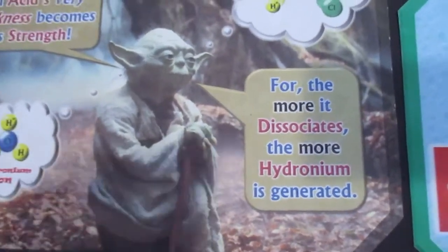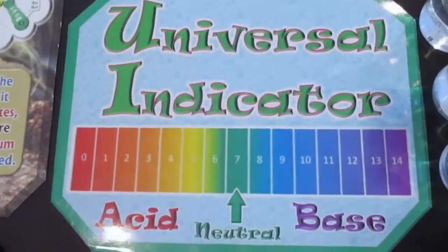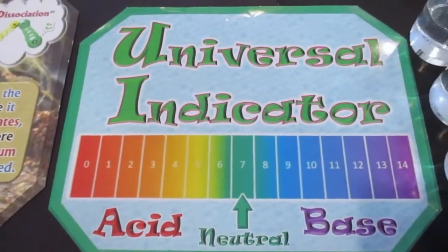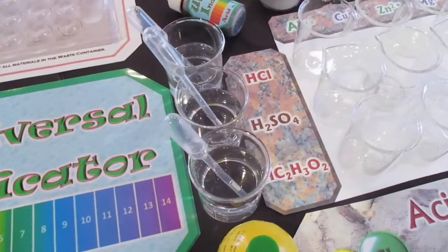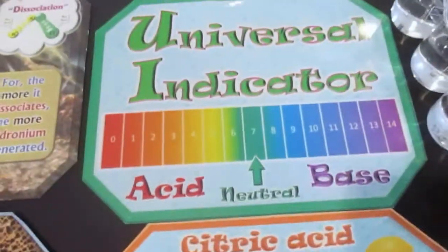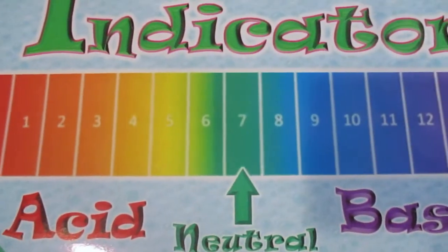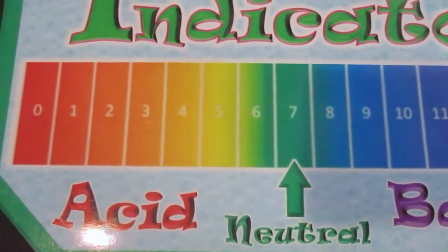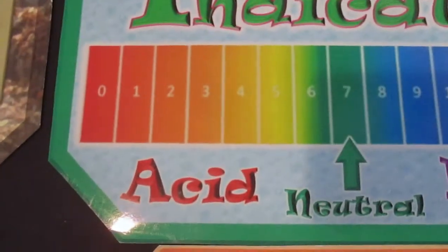And then, of course, we have a scale for measuring that: the pH scale, which measures the concentration of hydronium or hydrogen ions in a solution, the power of hydrogen. These are all acids. So what color do we expect it to turn when we put in the drops of universal indicator? Certainly not purple, not blue, not even green. That would be distilled water, because bases are purple and blue. Distilled water is green. Yellow would be a pretty weak acid, or a pretty low concentration, let's say.